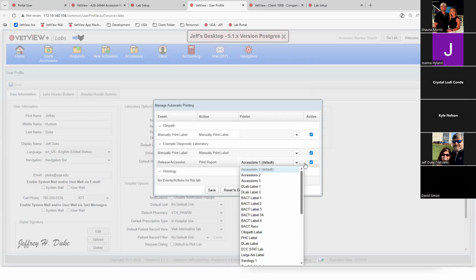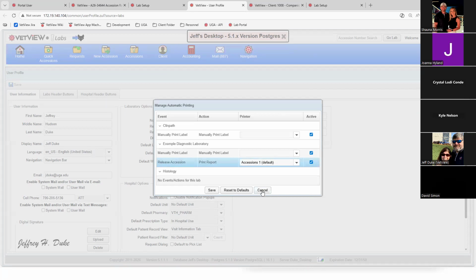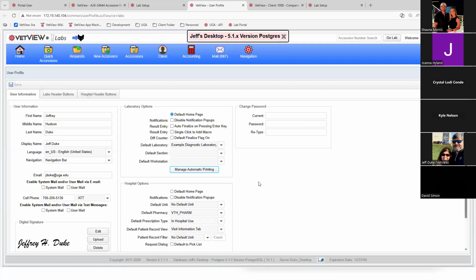It's any printer that you can set up on your server. So if you're using Linux through CUPS or Windows using Windows Print Server, so Zebras, Dymos, all of them these days we can connect to them. And what we're printing is a PDF file, so all those printers can accept PDFs and print them out. We haven't really run into any printer that doesn't work that way. A lot of them do still use Zebra for your thermal transfers or heat transfer. But again, you can use any you want to.